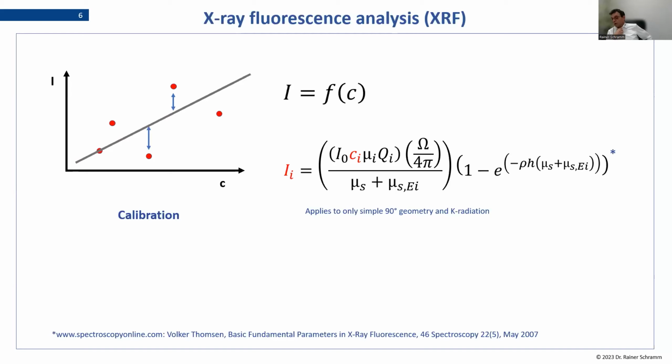But of course, it has to be stable with the sample. So you always have to do a test. Does the film really last with your sample? Does it leak? This is always important, that you avoid any leakage, that you do not destroy your XRF device. So you have to see what elements you're analyzing, how thick must the film be, and how well does your film last with the sample.